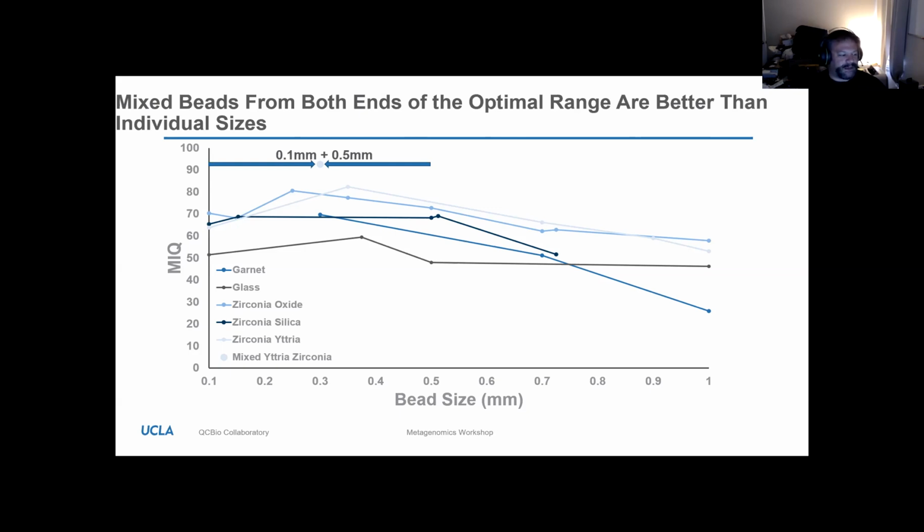And Timothy's asking if these are from Zymo. So again, aside from standards, which I'm just kind of a big believer in, if somebody else comes up with a standard that also has a very well stated expected abundance and manufacturing tolerance, I will actually discuss that in the class as well. You can definitely get beads similar to this from Zymo.